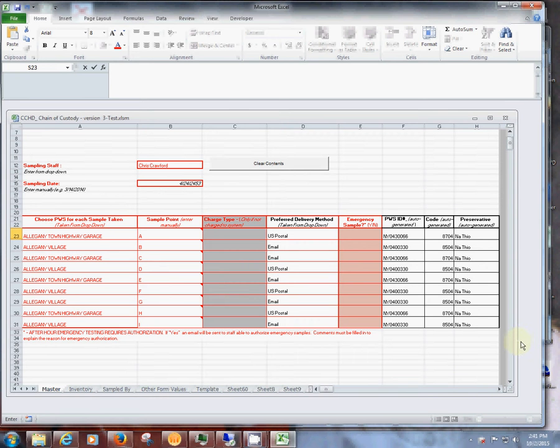Hello and welcome to video 3 of the Cattaraugus County Health Department Laboratory Information Systems video tutorials. In this video tutorial we will look at the chain of custody form.